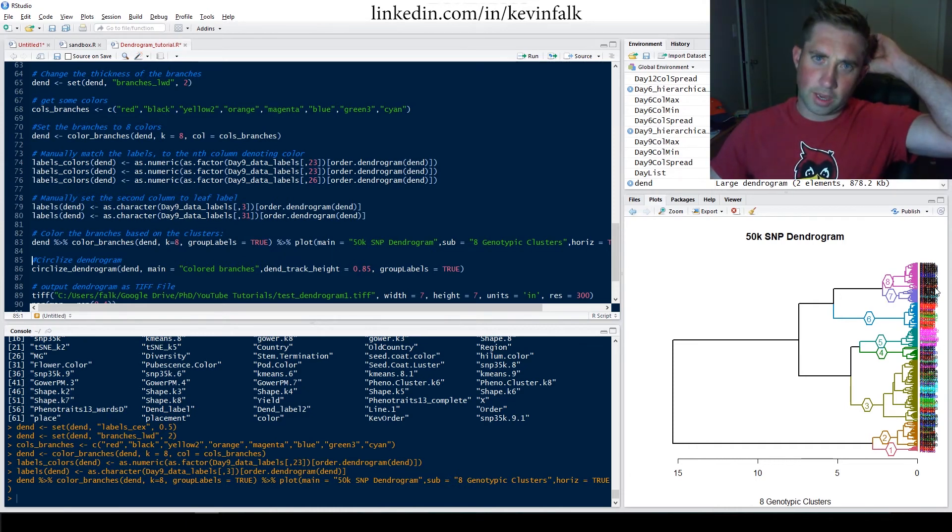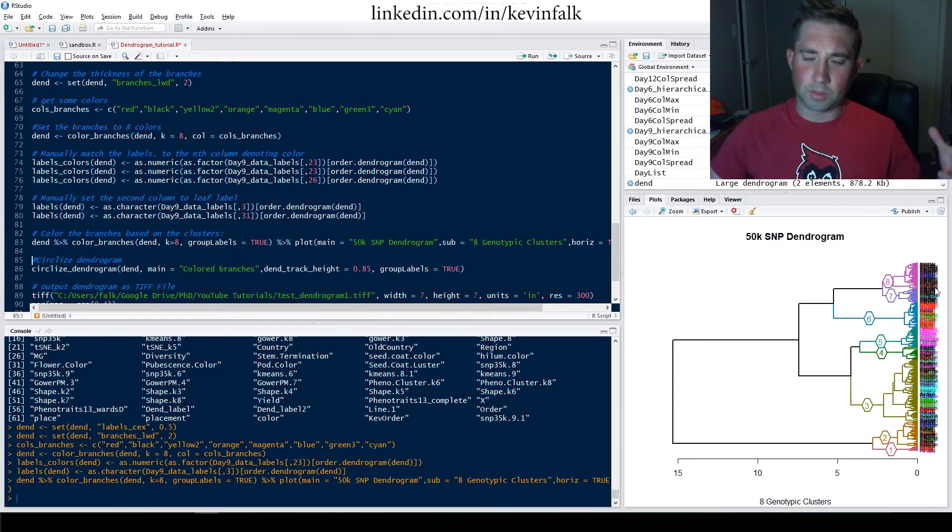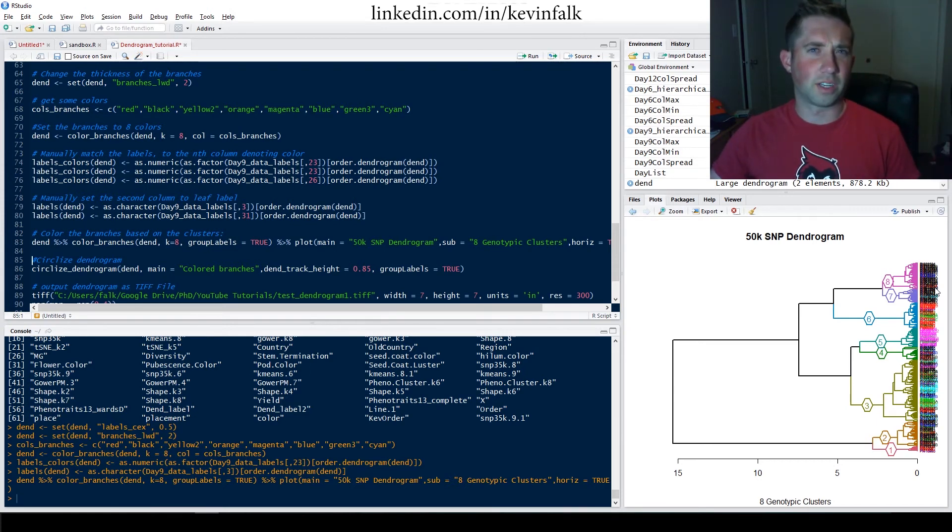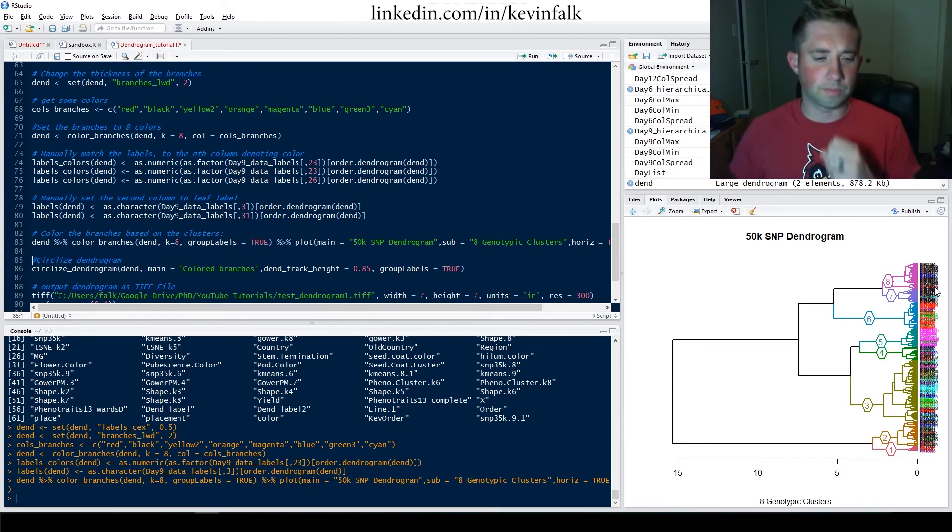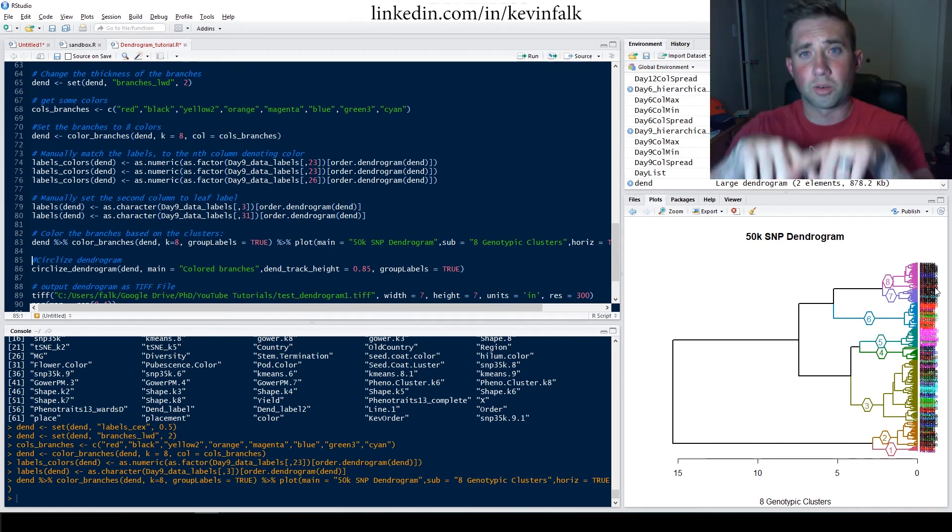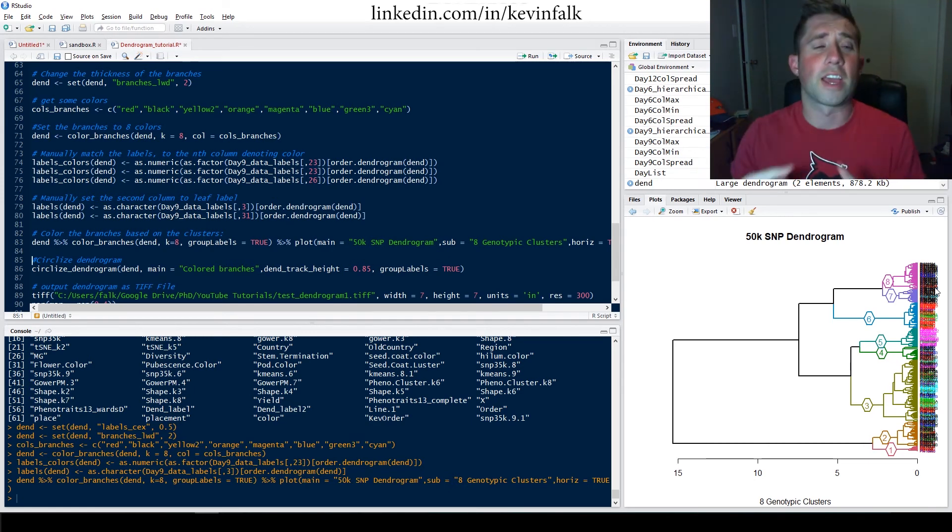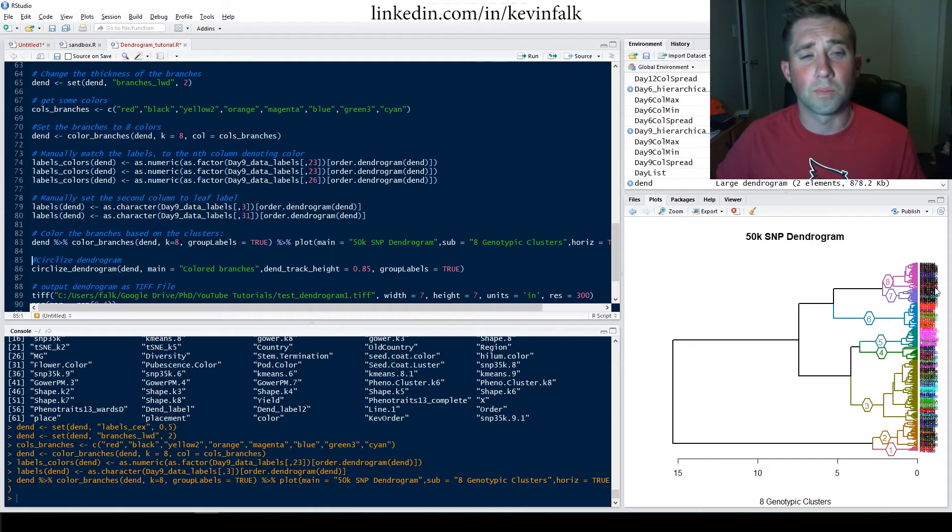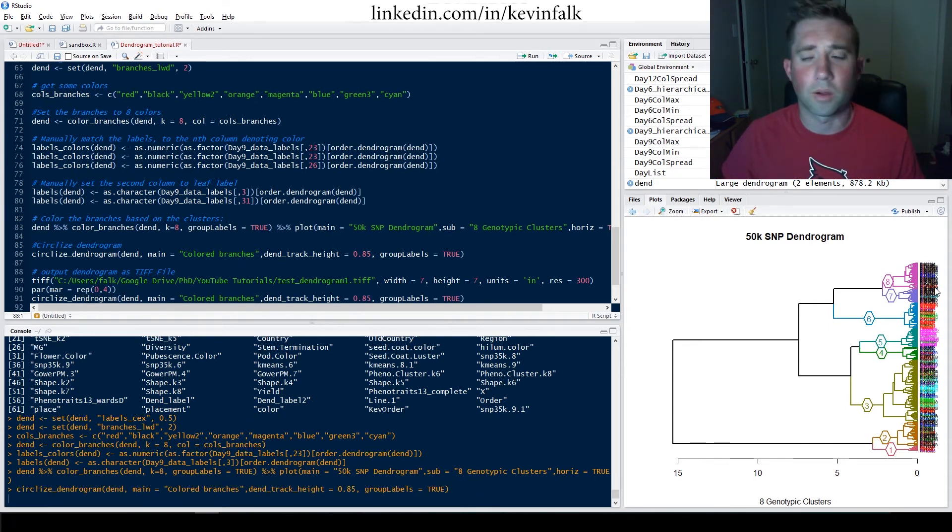Now, the issue that we have is because I have so much data, it really doesn't visualize very nicely because it's all crammed into a space. So I use a circulized dendrogram function in order to spread it, fan it out, essentially, and make it more easily read. So I'm going to run that now.